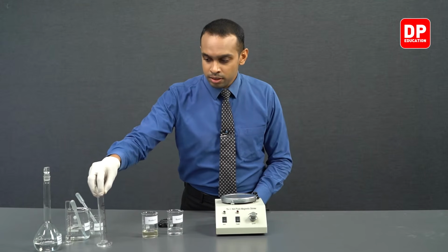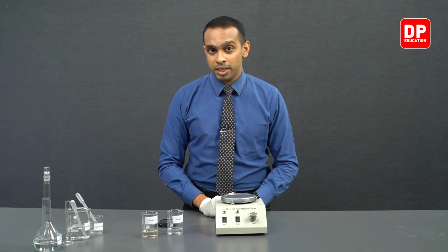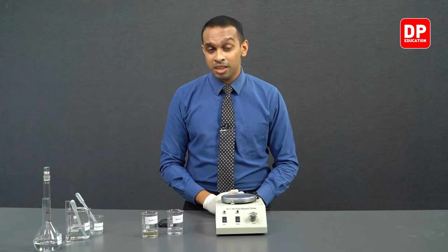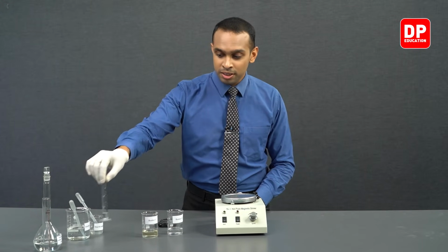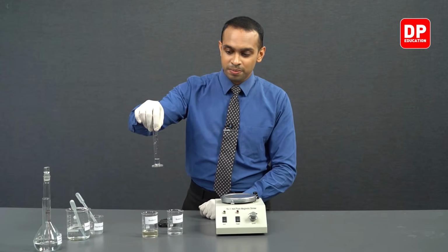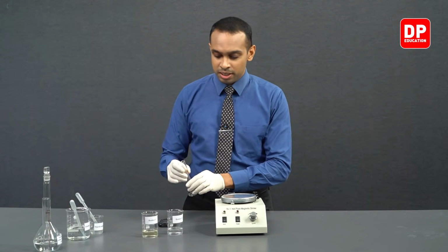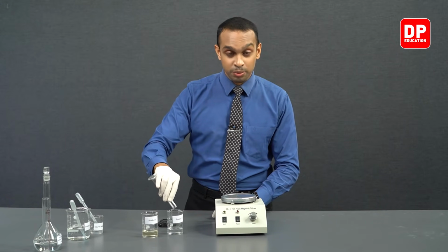And since we have decreased the volume of potassium iodide solution by 2 cubic centimeters, we have to replace that 2 cubic centimeters by adding distilled water. So here we have 2 cubic centimeters measured. This is distilled water, and we will be adding these 2 cubic centimeters of distilled water into beaker 2 as well.